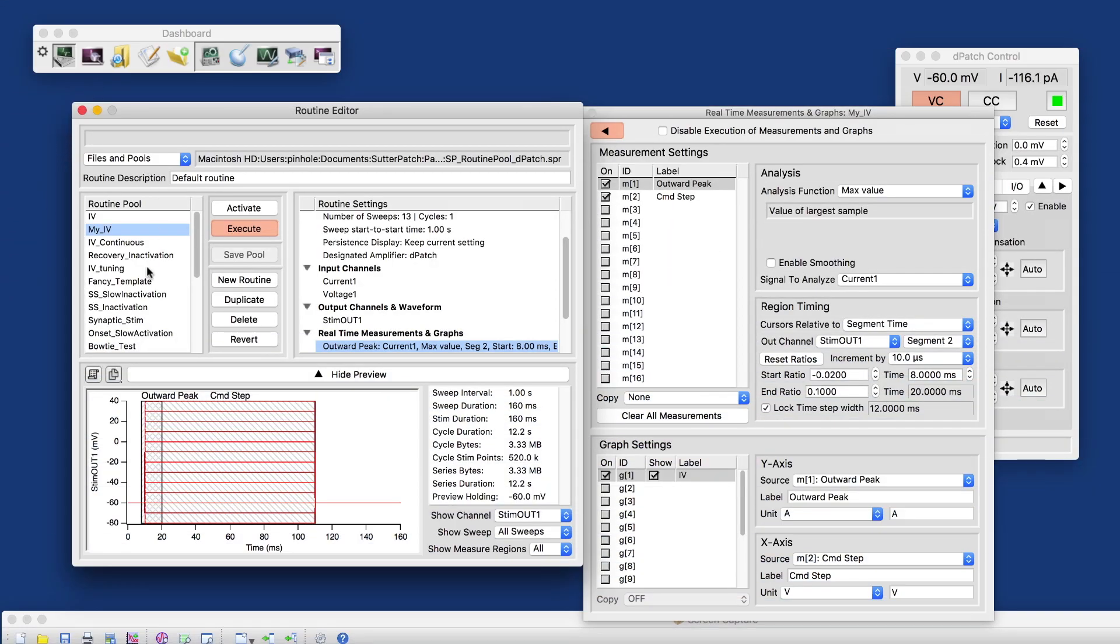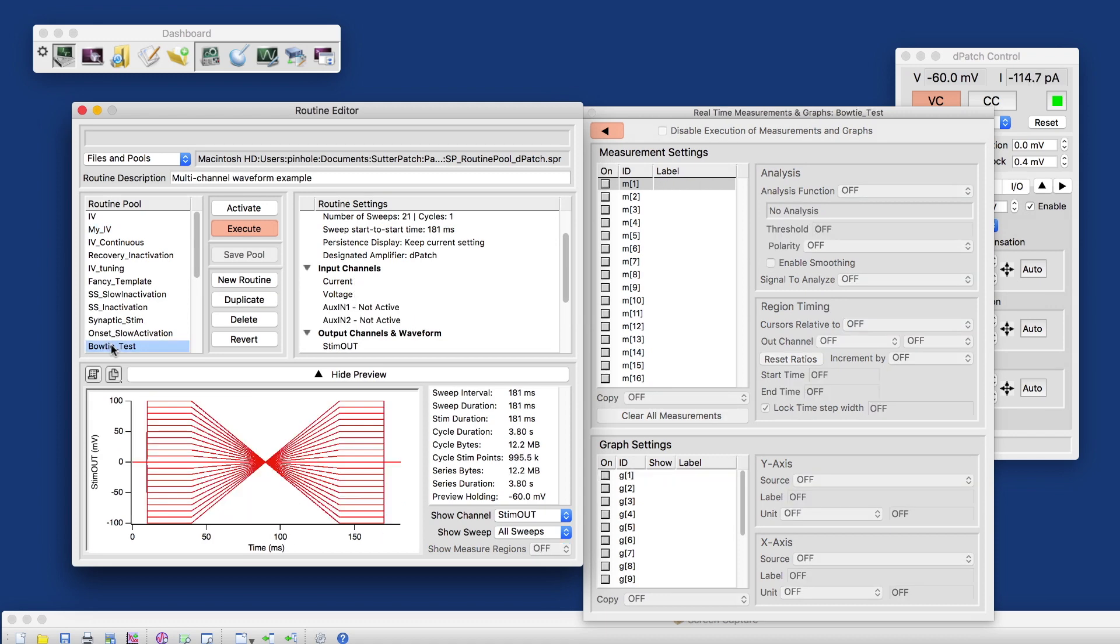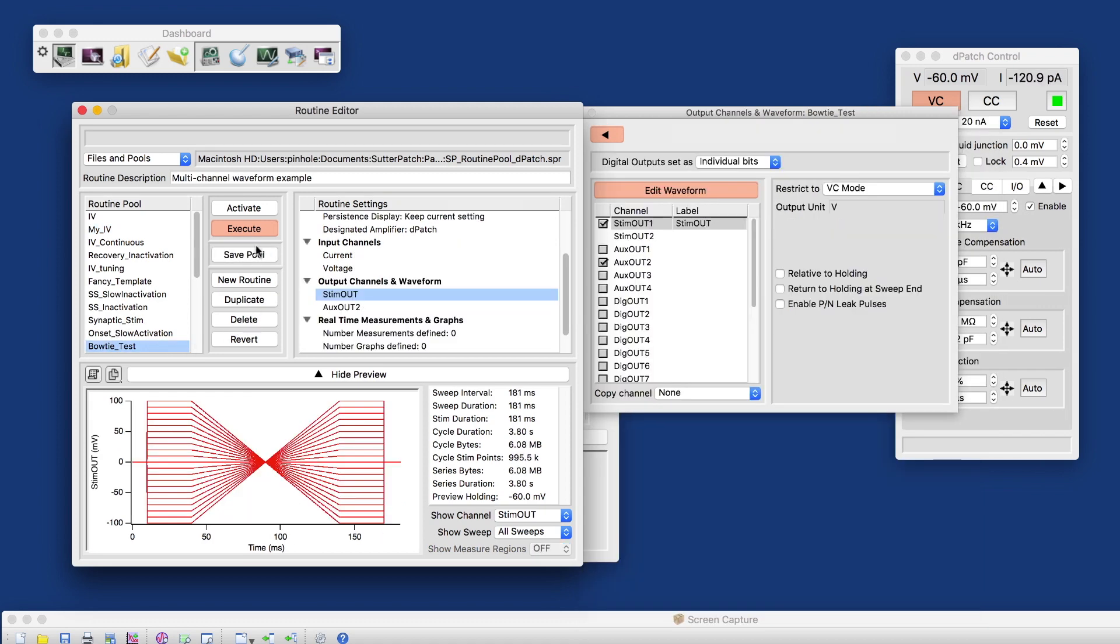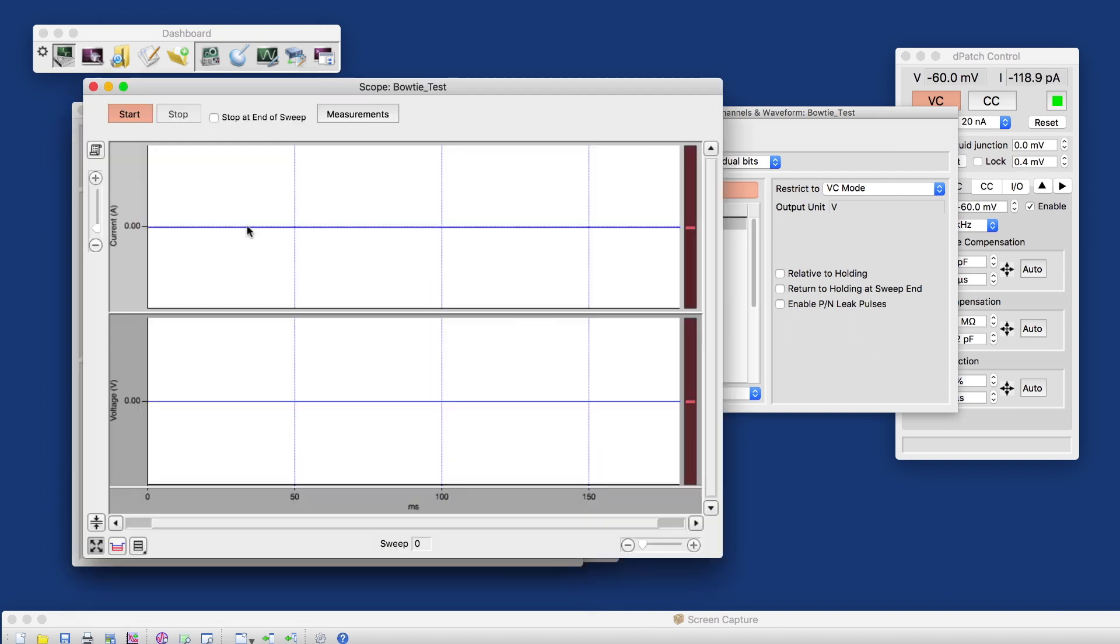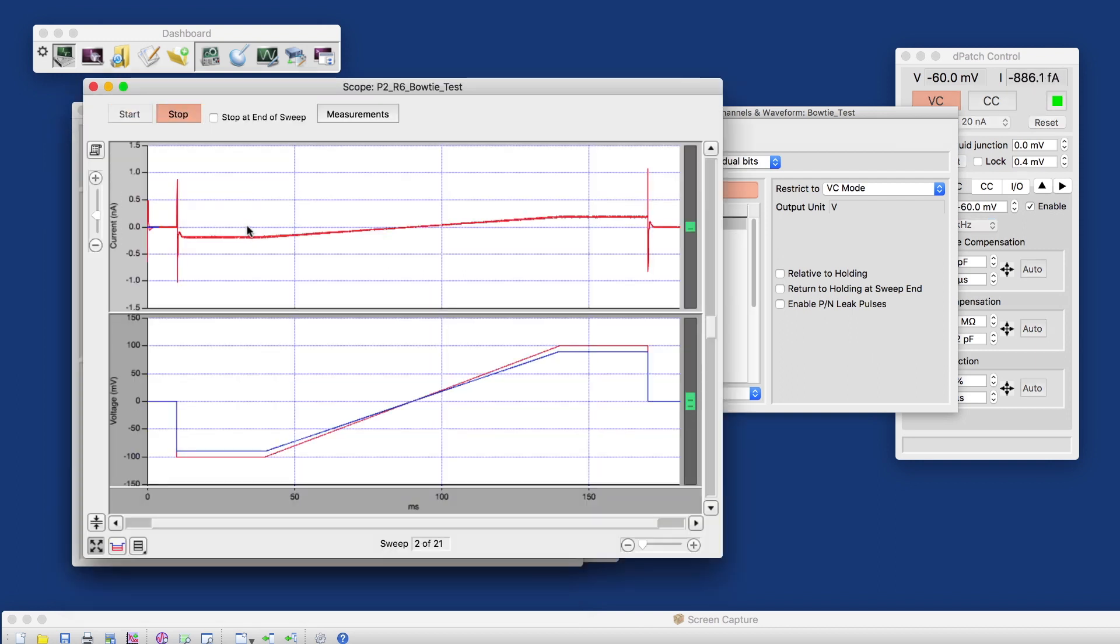Now, what I'm going to do is I'll run the Bowtie test here, which is scientifically completely meaningless, but this is a pretty useful waveform for amplifier testing, for testing linear responses, things like that.